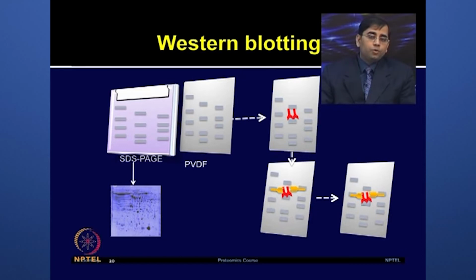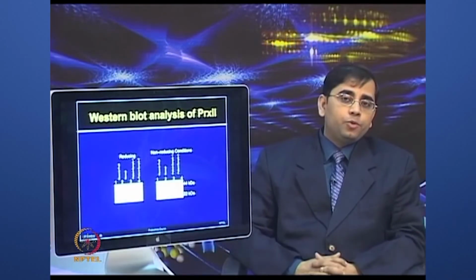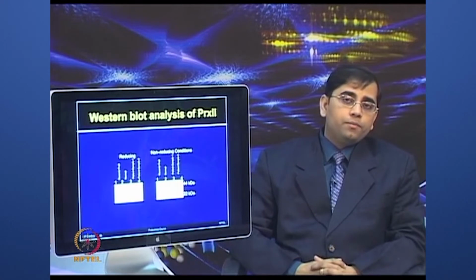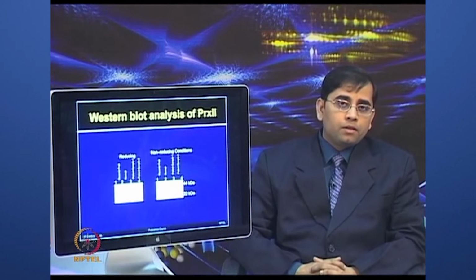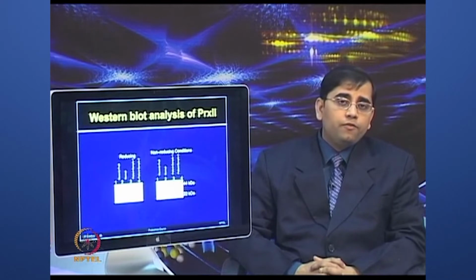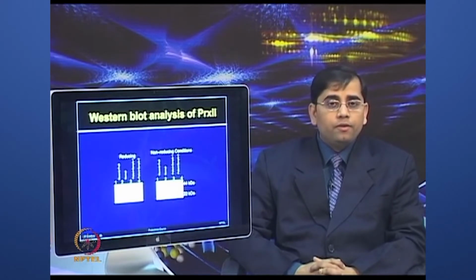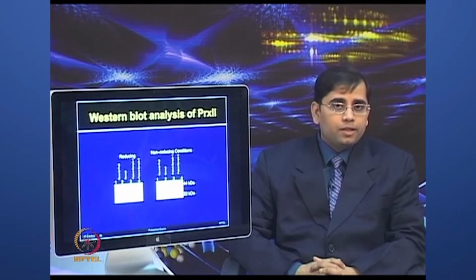After the identity of these proteins was established, Western blot analysis was used to validate a few targets. Among the identified proteins, the authors found that peroxiredoxin 2 was very interesting. So, they observed that an intracellular protein, PRX2, was exclusively found in the plasma of SARS patients, but was absent in the healthy individuals.